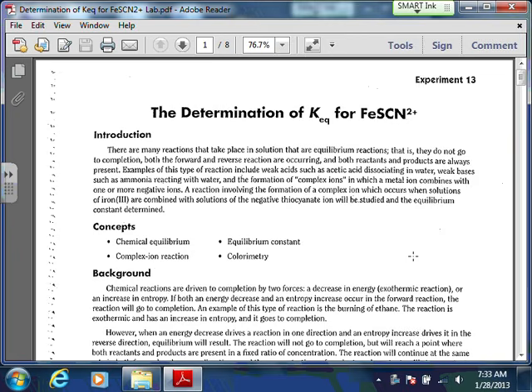using absorbance. And this works when you have a reaction that changes color. You can actually measure the absorbance of certain wavelengths of light. And that will basically tell you how concentrated the solution is, and there's actually a formula you can use to get you from absorbance to concentration. So that's kind of the strategy we're going to use here. And the nice thing about that is sometimes when we're working with very, very low concentrations of things, it's easier to measure the concentration using this particular method.